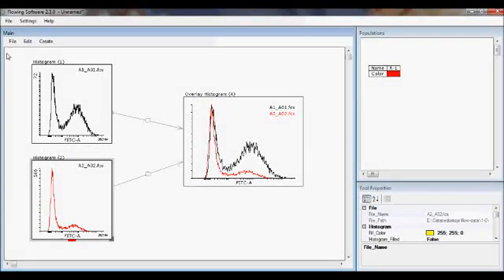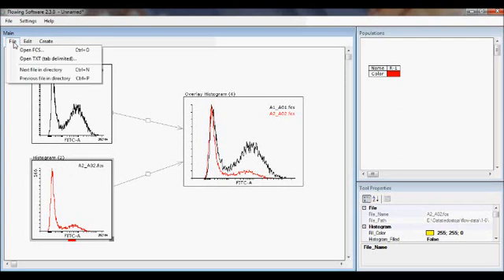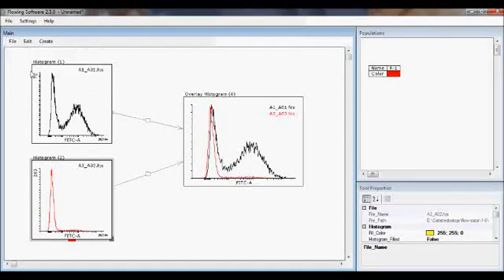And the idea is that whatever happens here in the master, it will be reflected to the servant. So, for example, if I jump to the next file in the directory, it is reflected here. If I create a new region here like this, it can be seen here.